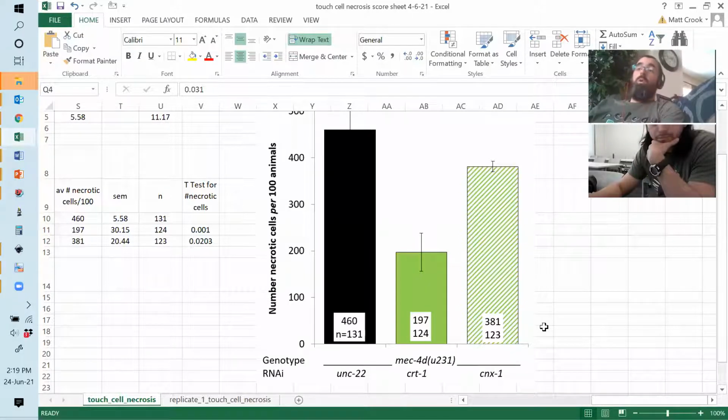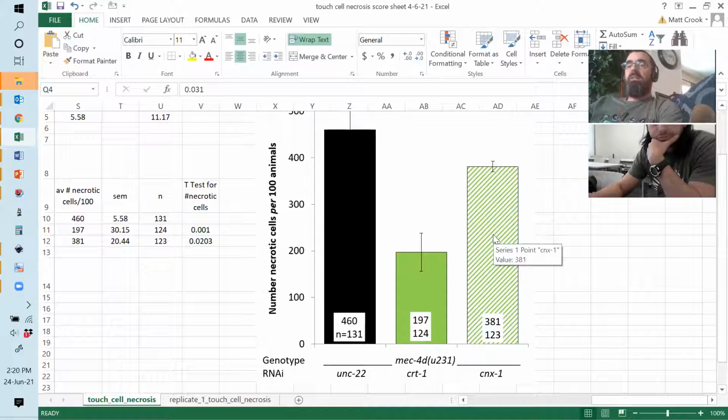So you look at this, you're like, oh, wow, okay, so this one is clearly a lot lower. Whether that's better or worse kind of depends on what the axis is. And this one is a bit lower, but not as low and actually kind of closer to this one. So that's visually accessible. Even if I didn't tell you anything about this, you could tell me exactly that back. This one's really different. This one's a bit different, maybe. We'll have to do the stats from this one, whatever this is, right? So that's the first step of the job.